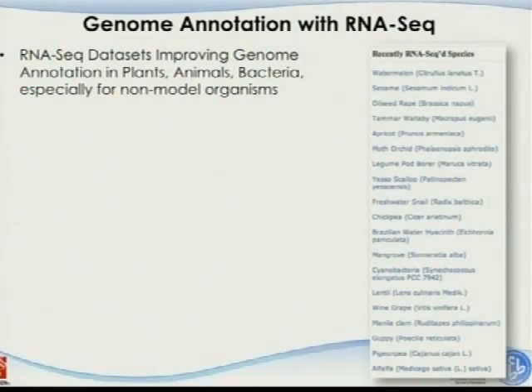But if it's not, we can do it, right? We know that BGI has a lot of machines sitting there and wants to sequence something. Last week we were at a conference, and there was one speaker from BGI, and the slides. BGI is the Beijing Genome Institute. They have a couple of hundred HiSeq machines.